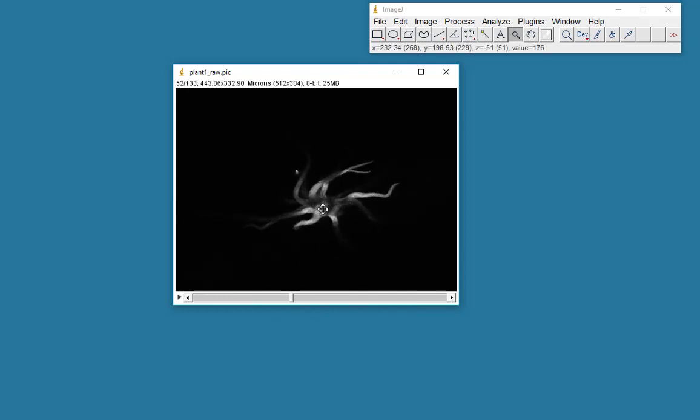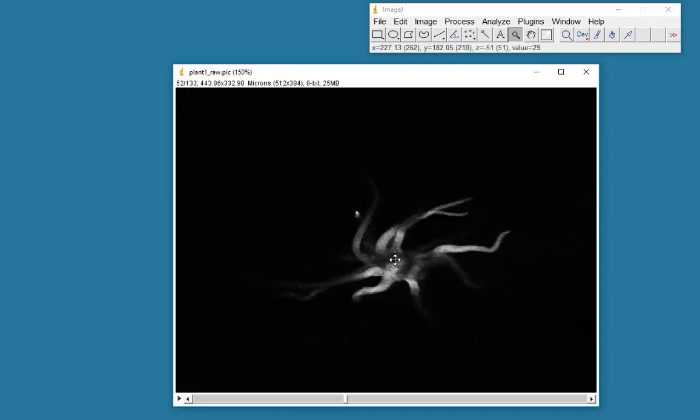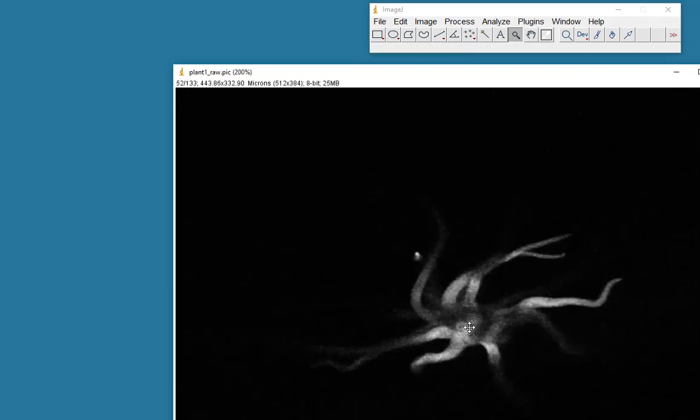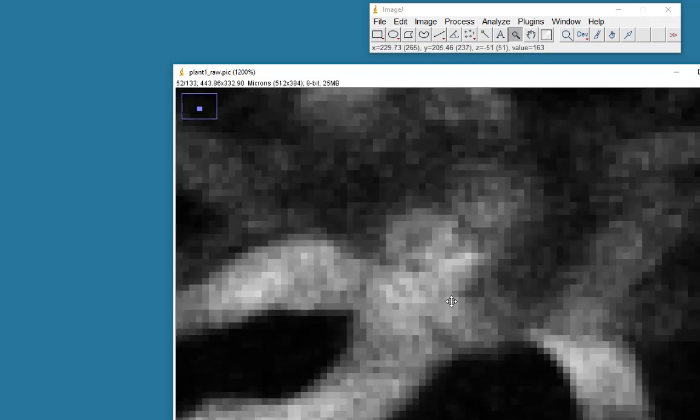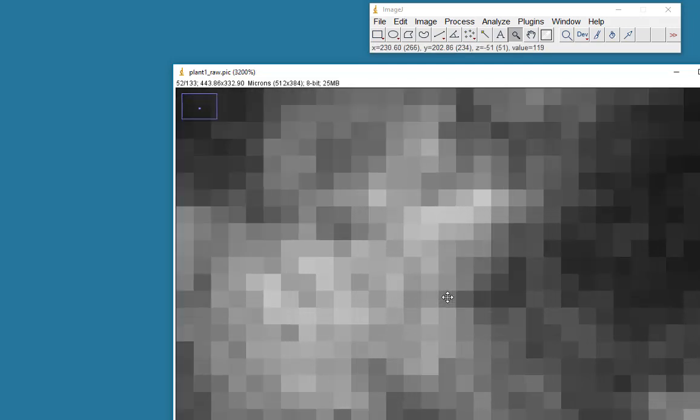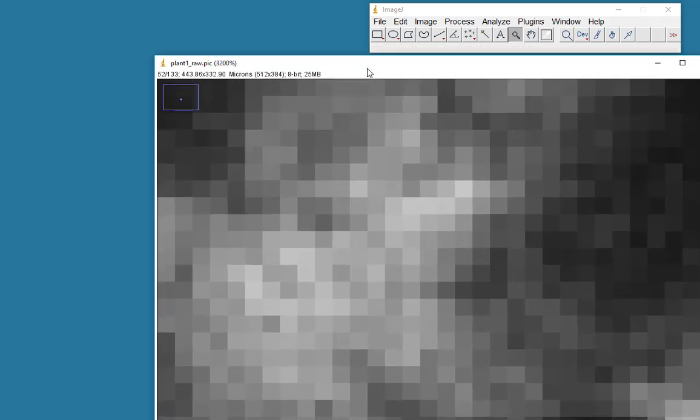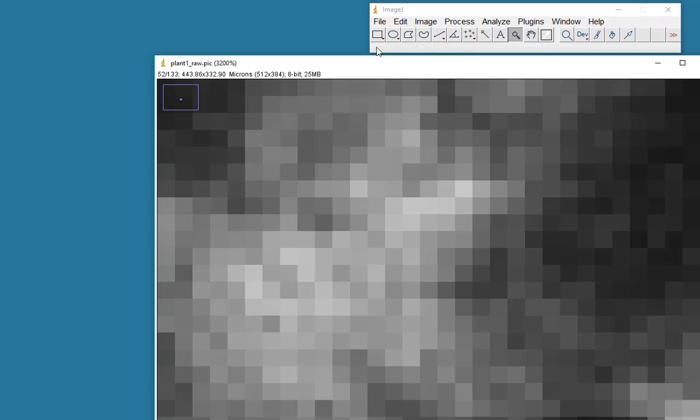If I zoom in on this data set, you'll see that if I leave the mouse cursor just at this point here, if you look at the numbers that are registered up here, you'll see that I have an X and Y location of 263 by 233. And the Z location is 51, which means it's slice 51.